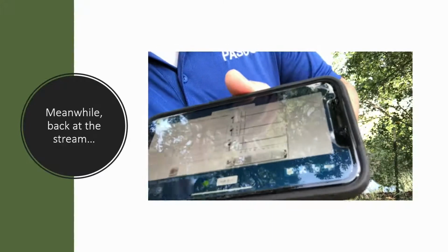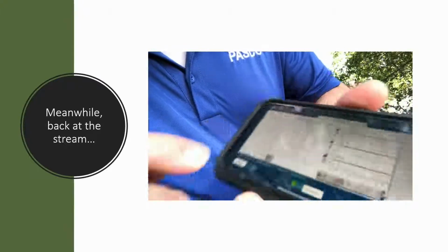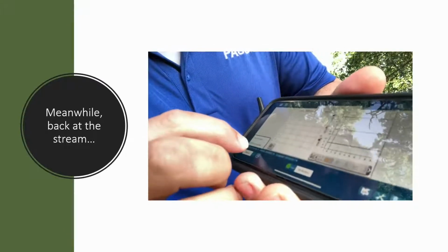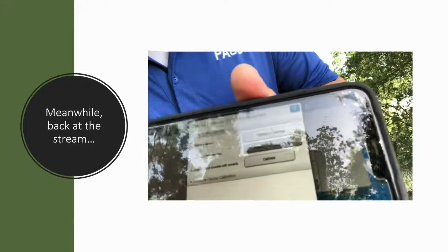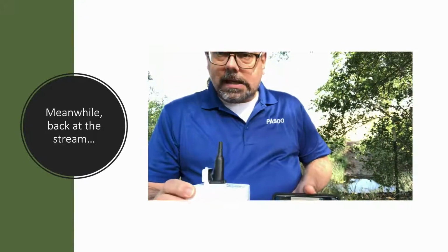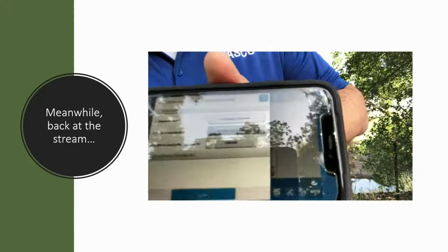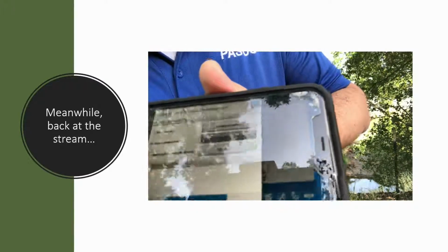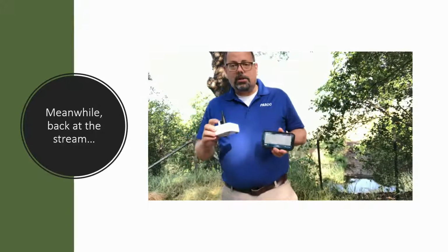Okay, last step we want to do is calibrate the colorimeter, and you can see where it says nitrate here. I'm going to click on that nitrate and say calibrate sensor, and right there you're going to put a clear solution into here, that comes with the ezSnap kit, and you're going to then just come in and say calibrate, and once you've hit that little check mark is there. Now you're ready to test your solution.